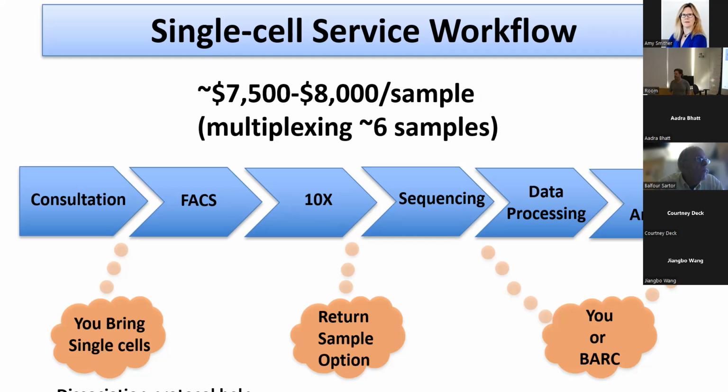And then the data processing is very similar to what I talked about for the bulk RNA sequencing, where you can do it in your lab if you have the expertise, or we can connect you with somebody in the BARC to establish a relationship for the downstream data analysis.